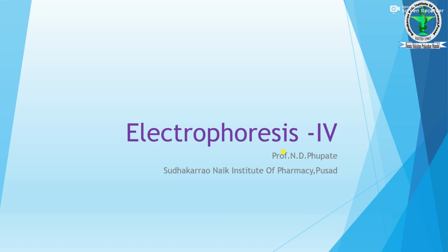In today's lecture, we are studying electrophoresis 4. Up till now, we have covered three different lectures on electrophoresis. We studied that we use paper for the separation and migration of drugs.